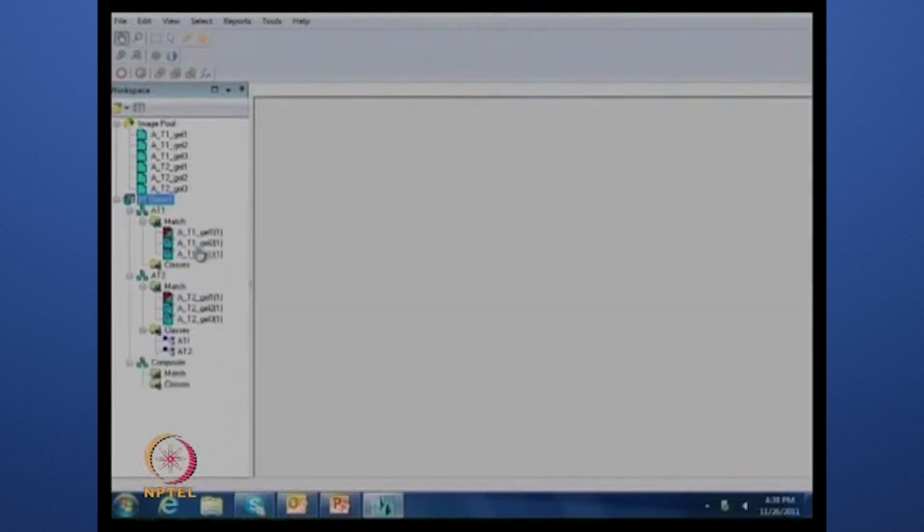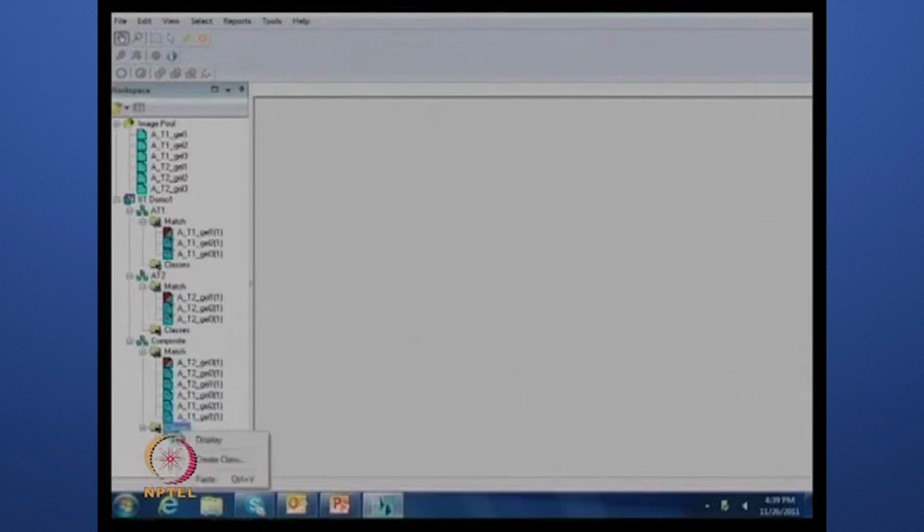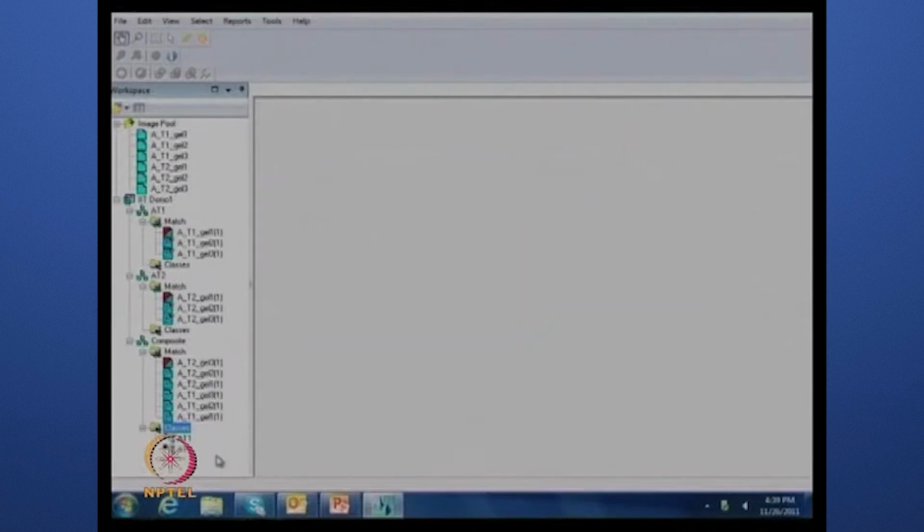Another match set which I am creating, where we can easily move before going to class. So you are moving all the 6 gels into a composite match set. All 6 gels are here, and now you can create classes again the same way. By adding different folders, one can avoid any carry-over mistakes from the previous one. Yes, exactly, so that all the steps are stored.